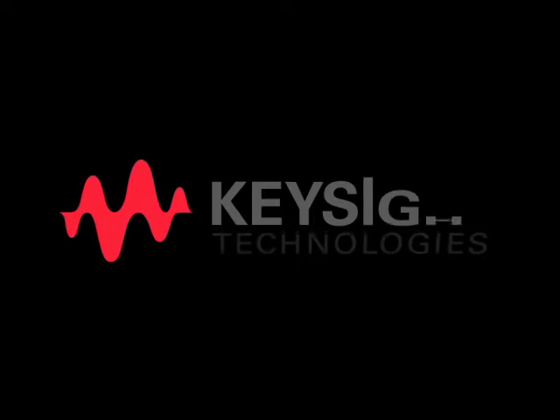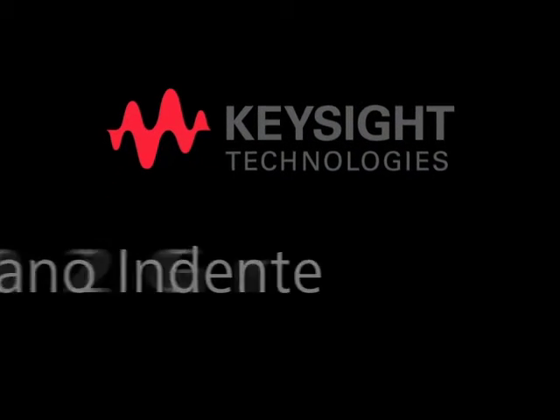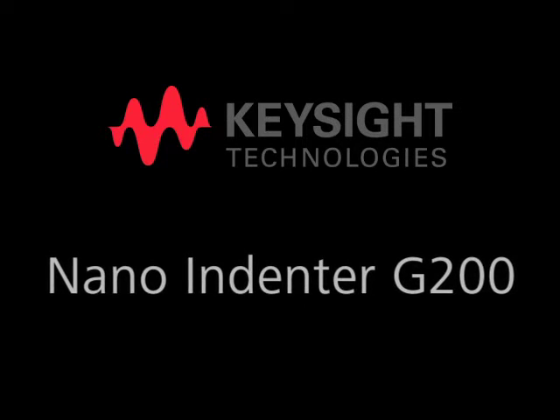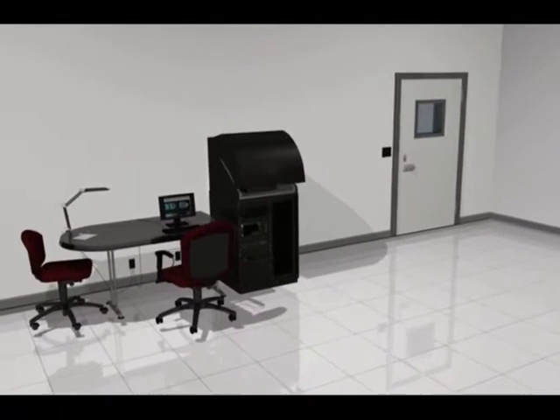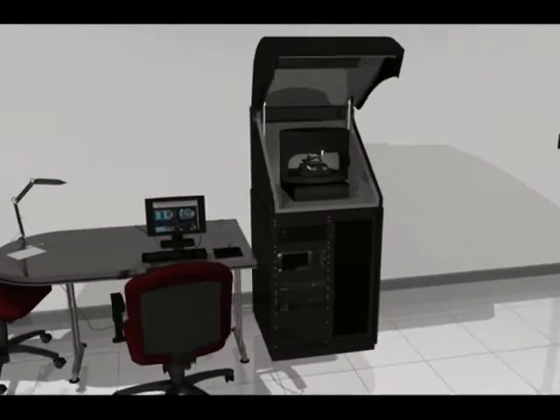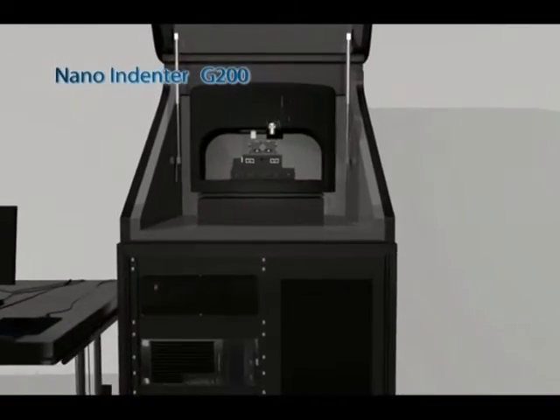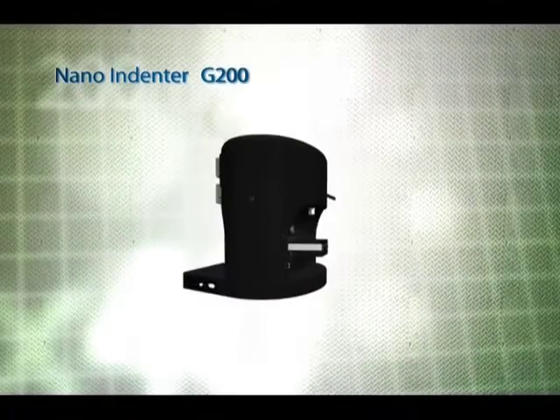Scientists and engineers have turned to nano indenter systems for 25 years for the utmost in measurement accuracy. The nano indenter G200 system continues this legacy of excellence. What you are seeing is a demonstration of 25 years of expertise.